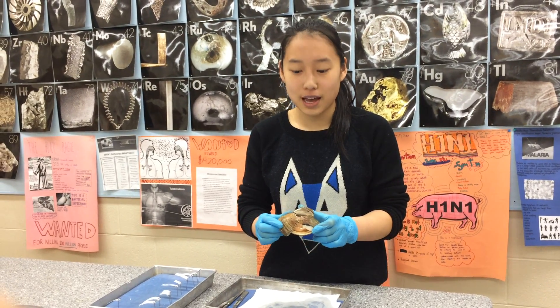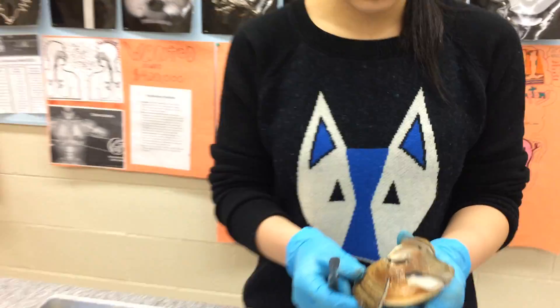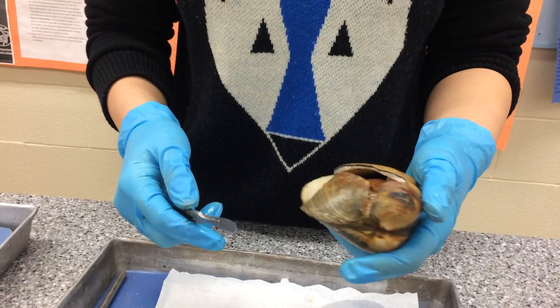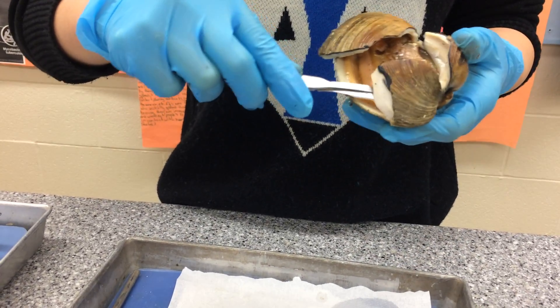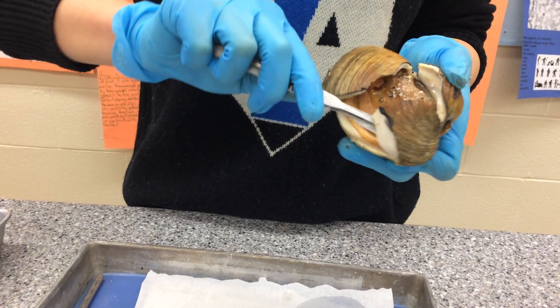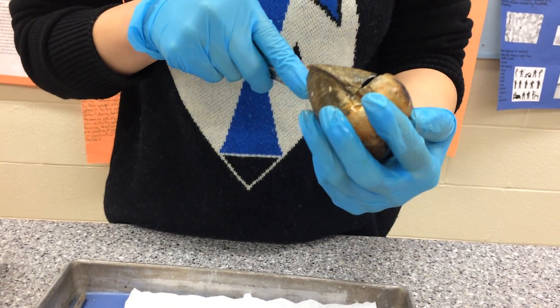I've opened the clam and I just need to open the valves. I do that by cutting the adductor muscles. I'll start with the anterior side, then I'll do the posterior side.